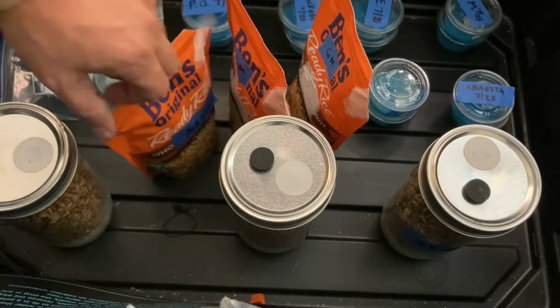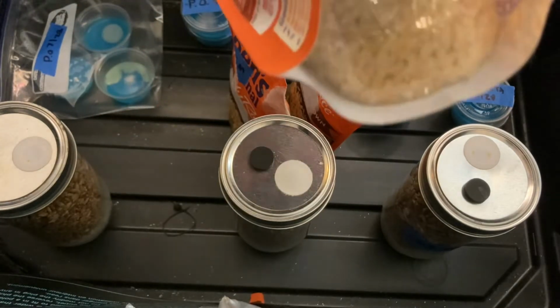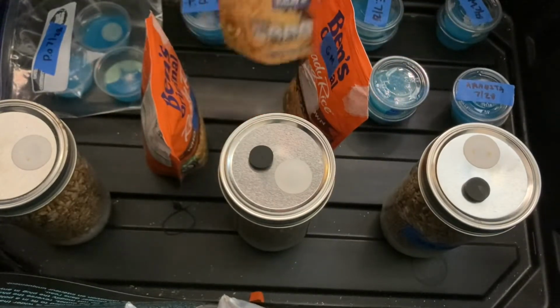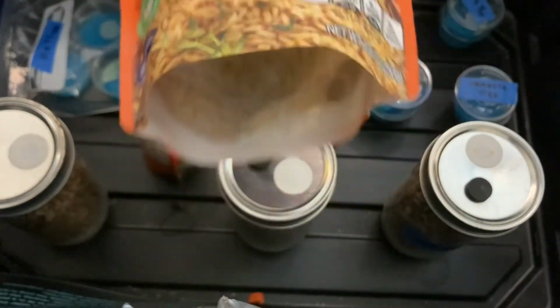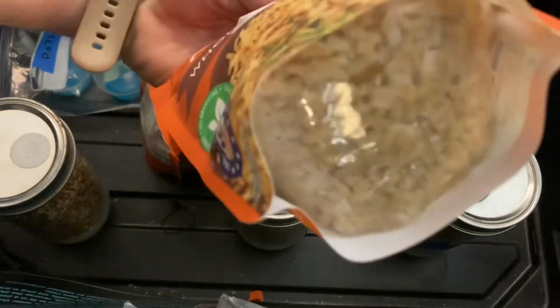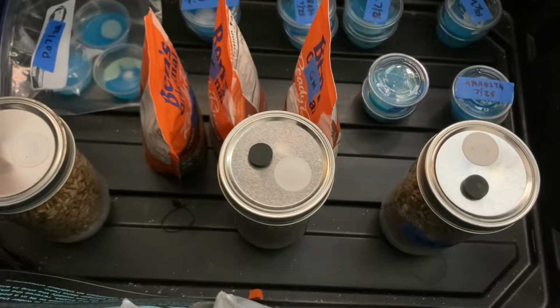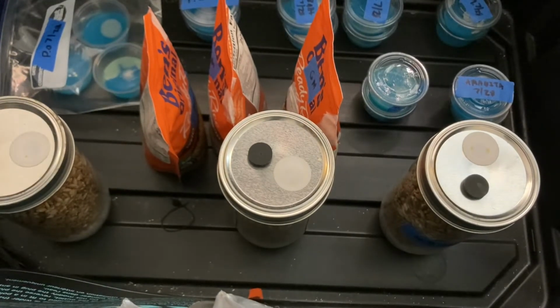And then I've tried some Uncle Ben's techs a couple different times, but I've never really had any luck with them. So I don't think I'm going to try them again. Just a little experiment I had going, but I've never gotten any mycelium to really show up in these things. They say that they should be completely colonized within 30 days, otherwise they start to ferment and can contaminate.